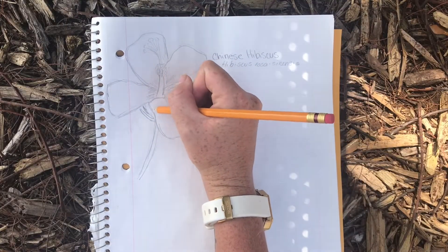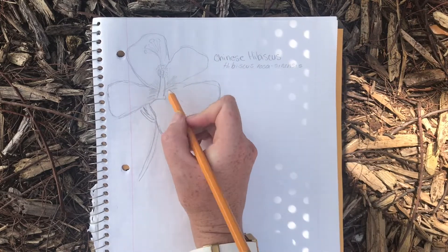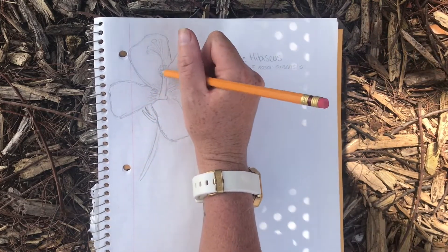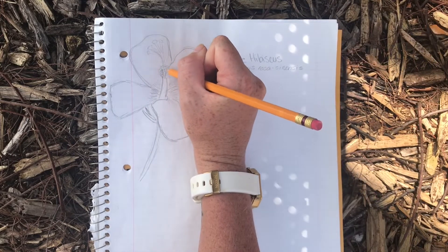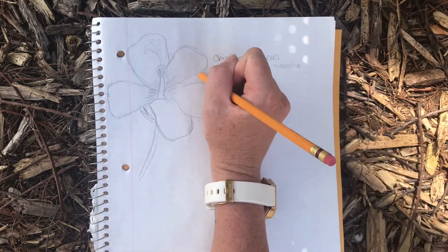Before starting the dissection, take some time to draw the flower. This way we can label it as we go along. Also write what plant it came from. If you're not sure of the species, you can always use iNaturalist or Picture This. They're two really great apps for plant identification.